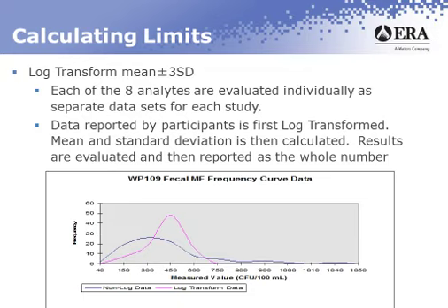The log-transformed data, you can see, starts to take a much more bell-shaped curve. So again, all data is treated exactly the same way, but you get to treat both the high and the low data points more fairly.